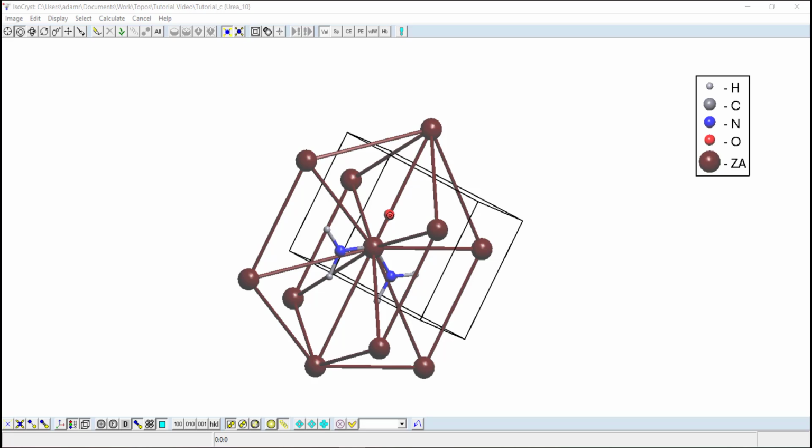I should also mention that left clicking selects and right clicking deselects when you have the select option chosen up here. So I'll select this central urea molecule and I'll enable van der Waals and hydrogen bonds. When I now press Grow, it'll grow the first atom on the neighbouring species because they're connected through these van der Waals and hydrogen bonds. Now if I use the Polymeric Chain selection tool again and click the original molecule, it will actually also include these extra atoms on the neighbouring molecules.